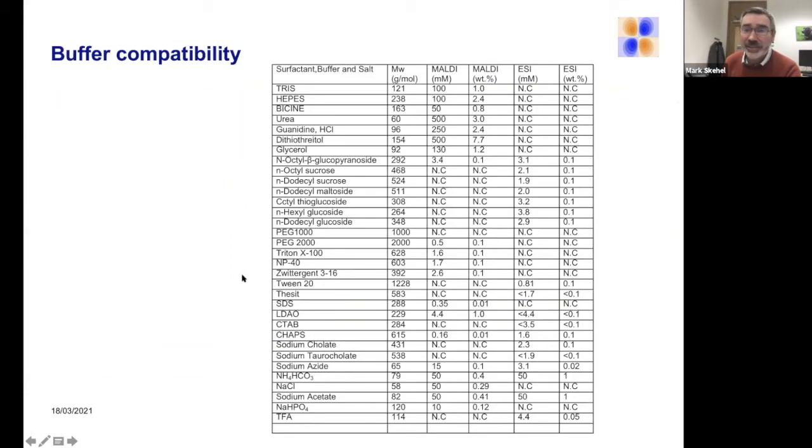It is a sensitive technique. The LCT is not coupled to a chromatograph. It's simply hooked up to an infusion pump. So you've got to be quite careful what buffer you've got it in. No detergents, they are the kiss of death to electrospray. Glycerol as well. And you should also not have your buffer in TFA. You get a strong suppression of signal in TFA.